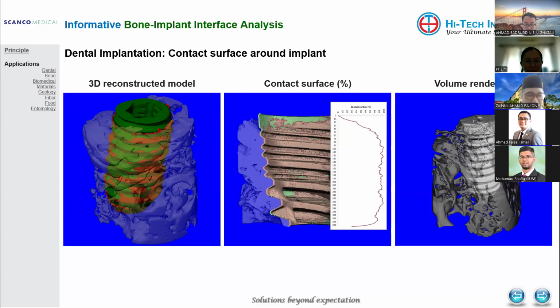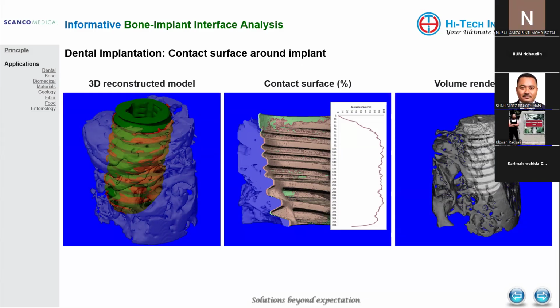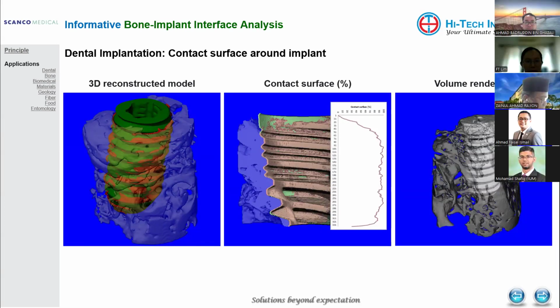But it is also good if you mention the values, the density, because we would like to see the density of the implant and the density of the bone, whether it should be different, but that shows there's some growth going on alongside the abutment of the implant. Yes, that's what I said. I think we can see more on integration. Your finite element analysis, simulation.